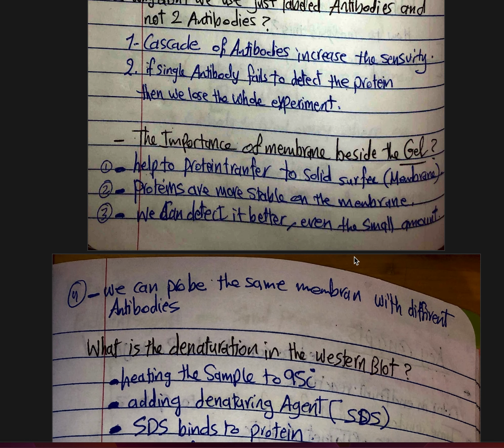Okay, and then the other question is, what is the importance of the membrane beside the gel? Why do we have the gel and then the membrane? It helps the protein transfer to the solid surface, which is a membrane. Proteins are more stable on the membrane and we detect them better, even a small amount. This is another question that may come to your mind. That's why we use the membrane beside the gel.